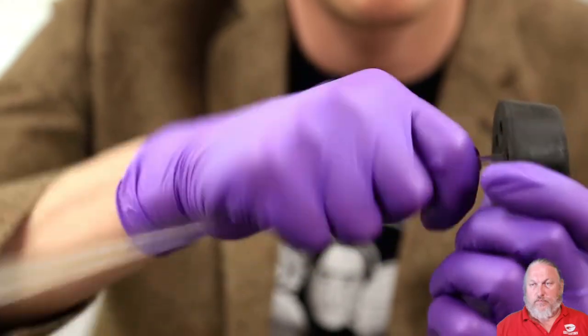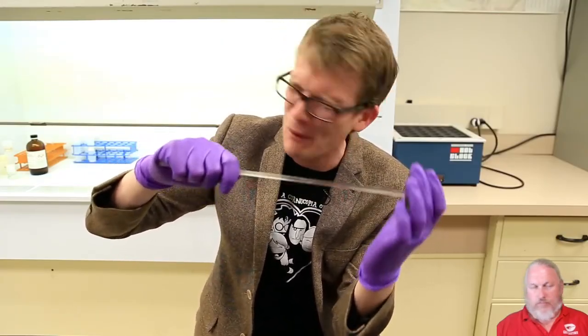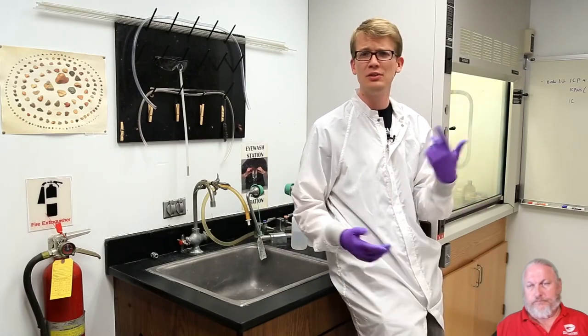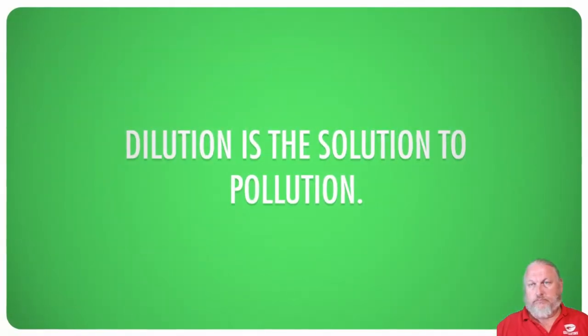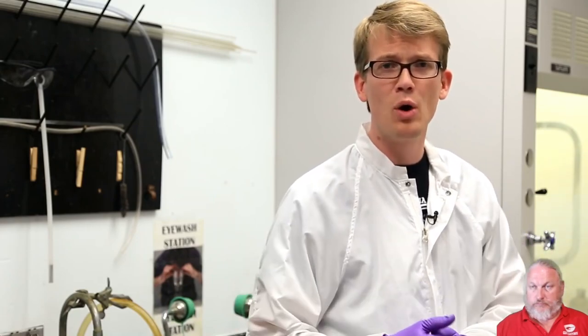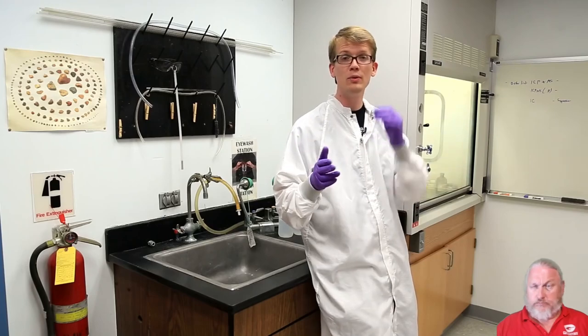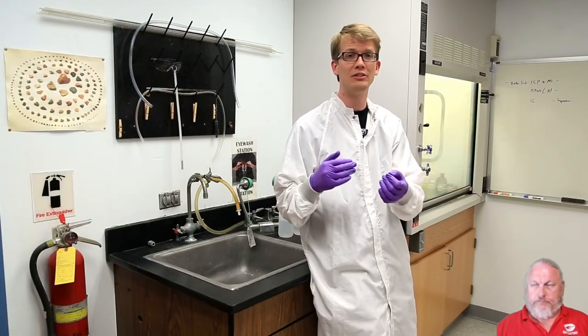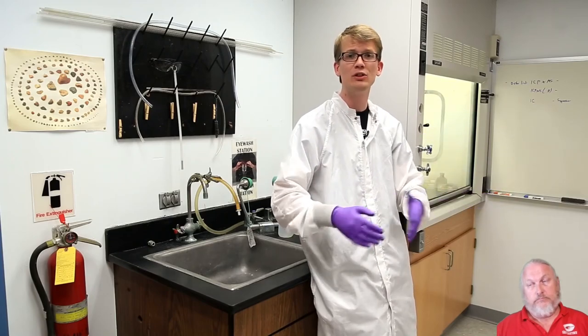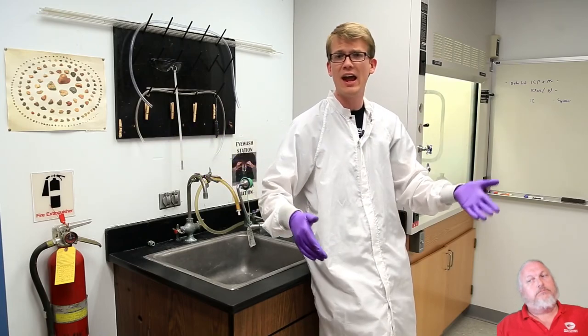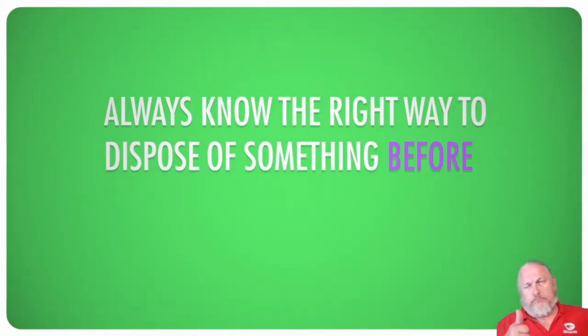When you're done with an experiment, do not just dump the results into the sink unless this has been explicitly approved by the person in charge of chemical safety. For some chemicals like common acids or bases, dilution is the solution to pollution. When they get diluted, all that's left is common ions like chloride ions from HCL or sodium ions from sodium hydroxide, in addition to some protons or hydroxide ions that are neutralized by buffer ions that are present in your sewage system anyway. Bottom line is they can be flushed with lots of water. For other chemicals, flushing is not a good idea. It probably won't hurt you but it might hurt the environment. Do put the products into an appropriate waste container, but not just any waste container. Different solvents and reagents have to be disposed of differently, and if you dump some stuff into the wrong container, it could totally end up reacting with the other things that have been dumped in there. Not good. Rule of thumb: always know the right way to dispose of something before you even start to use it.